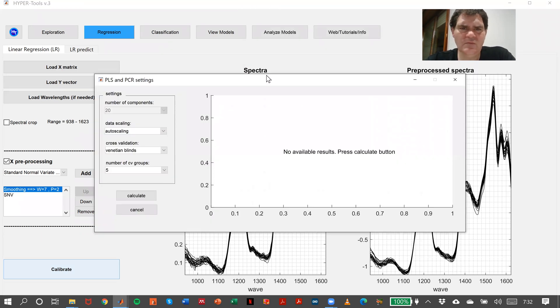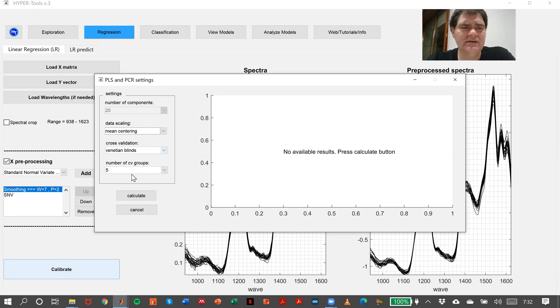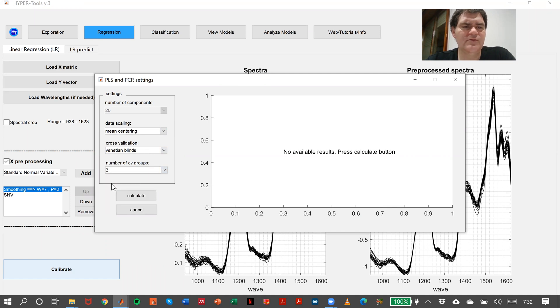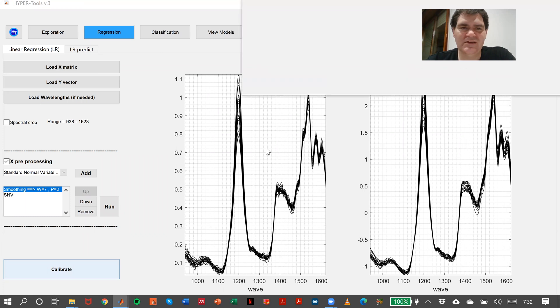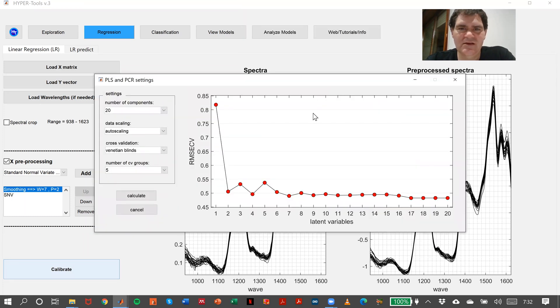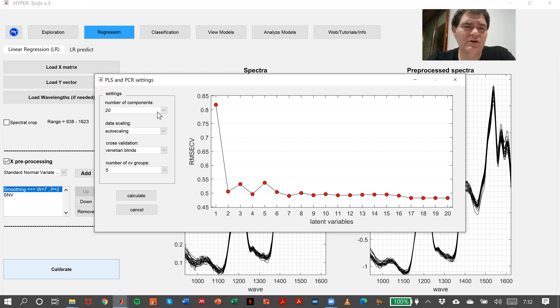As you can see, the settings are very similar to the ones before in classification: centering and three sets for cross-validation. The latent variables we can choose here. I think with two we have more than enough.